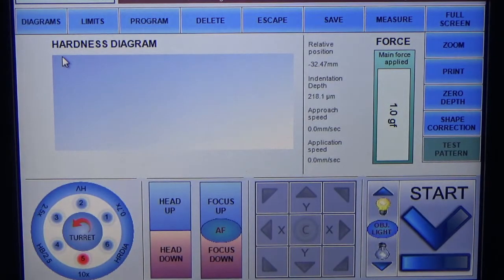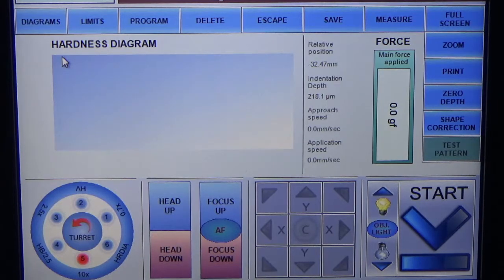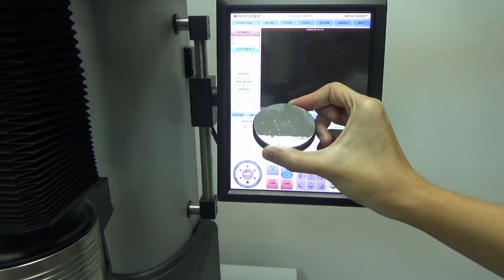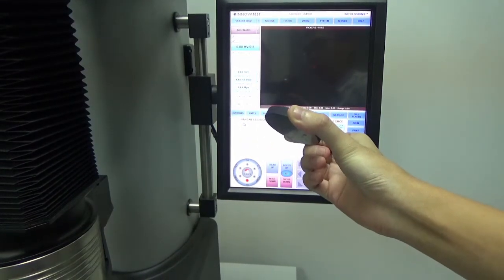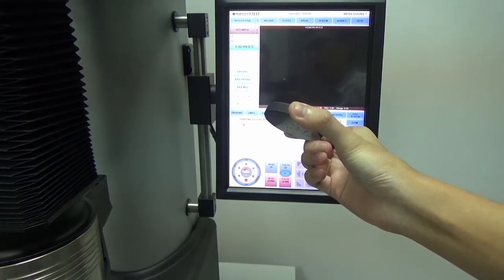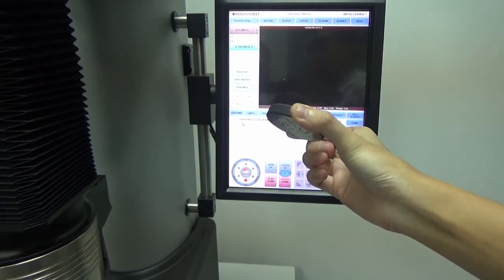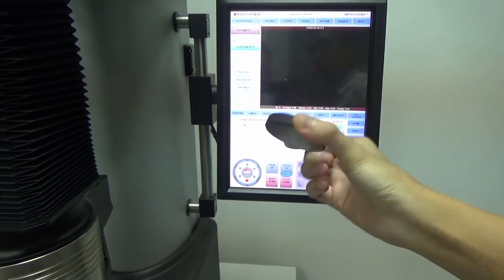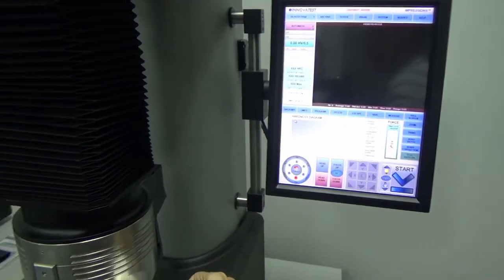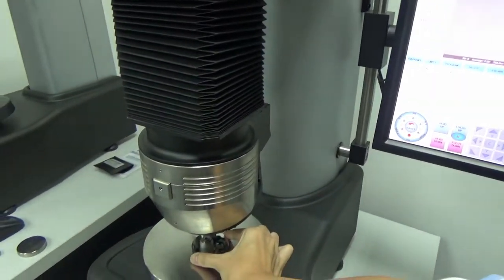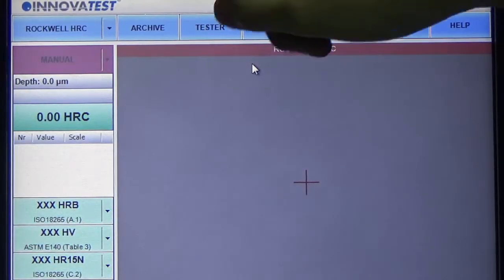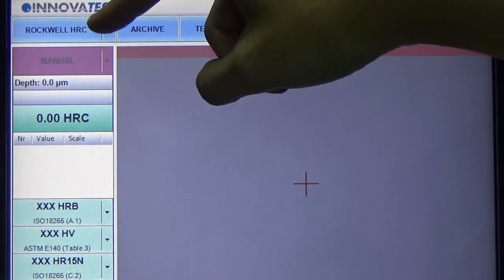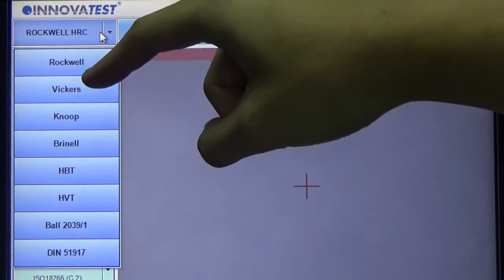Now we are going to do a Vickers test with 500 grams of force. This equipment is fully automatic, so what you have to do is just put your sample on the sample table. As you can see, here is the Rockwell scale, so we have to first change the scale to Vickers 500 grams of force.